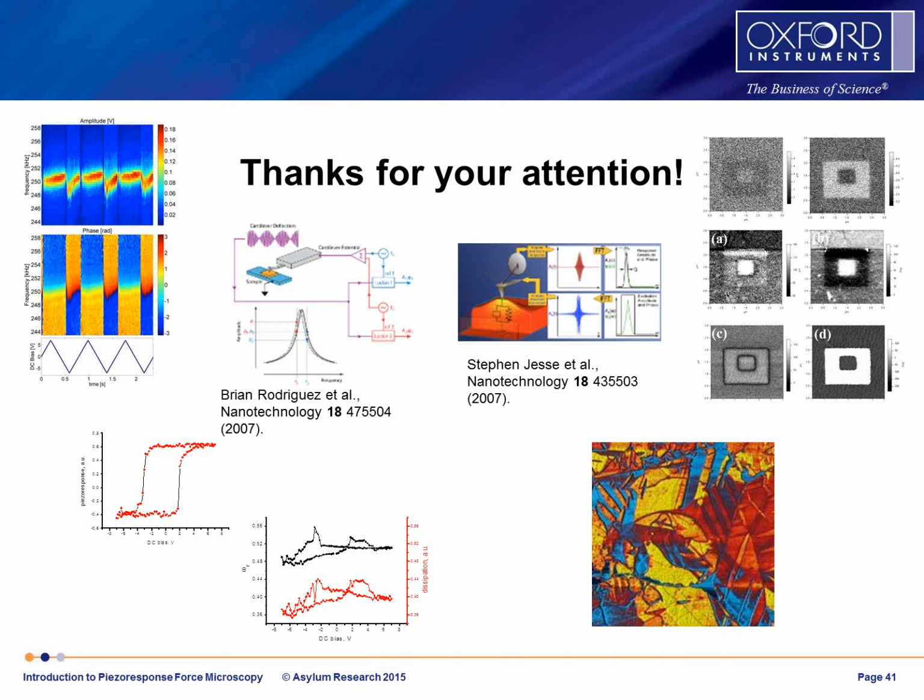And it turns out that at the high frequencies, cantilever oscillation in air and liquid are very much comparable because the only effect is the hydrodynamic damping, which is kind of low in these conditions. The second consideration is the electrochemical reactions and whether the cantilever can deliver sufficient voltage to the surface.